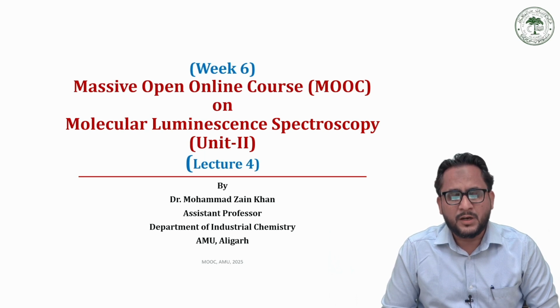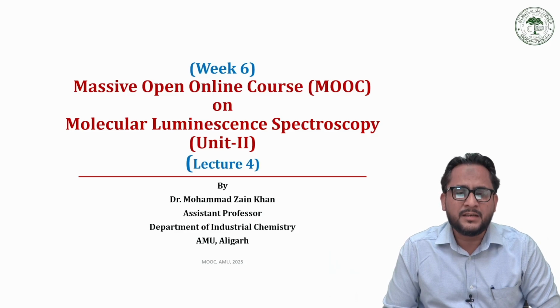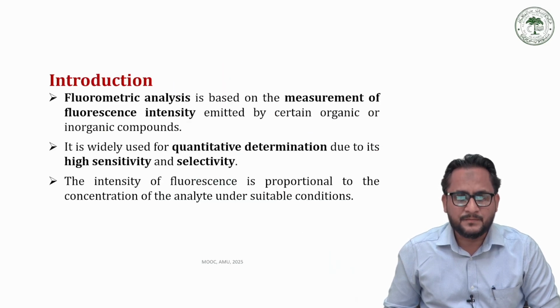Electrons are promoted to a higher level. When they come back, they release light. So there is a chemical reaction which is the driving force for this visible light, and these chemiluminescence phenomena are very interesting. We also use them for the detection of blood and various other tests.